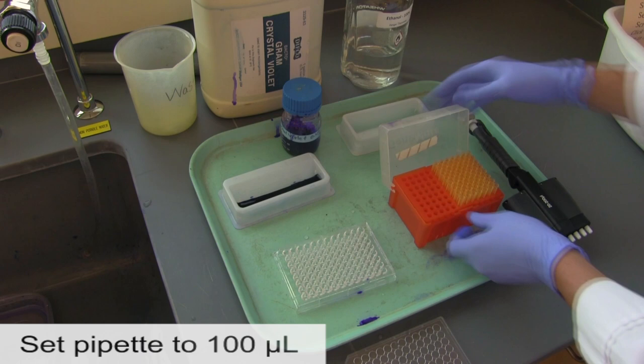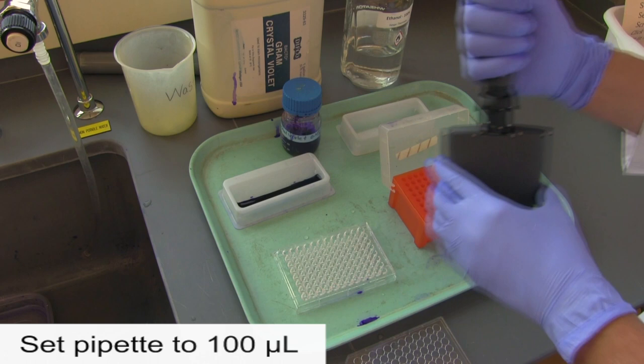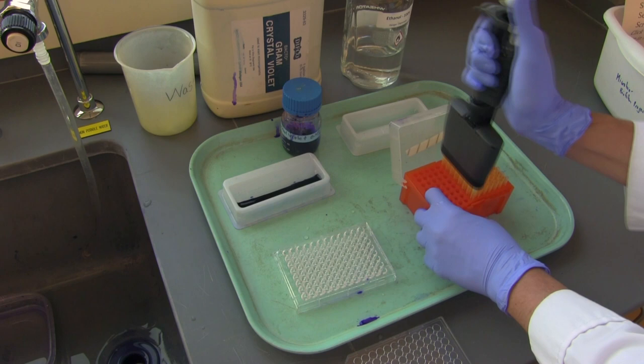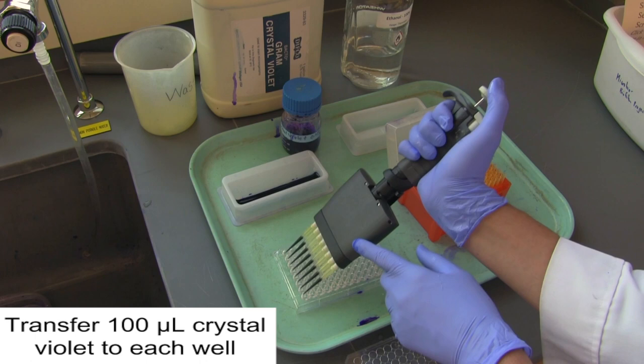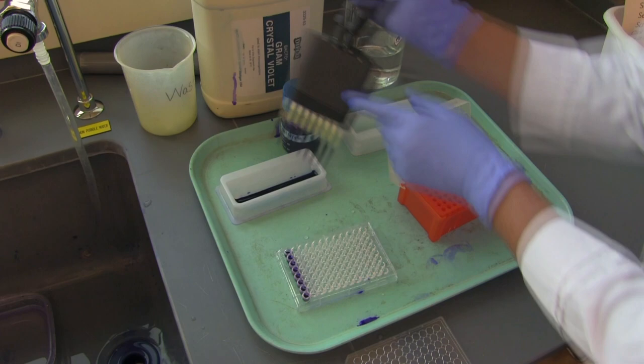Next, set your multi-channel pipette to 100 microliters. Pick up eight tips and transfer 100 microliters of crystal violet into each well. You may reuse the same tips.